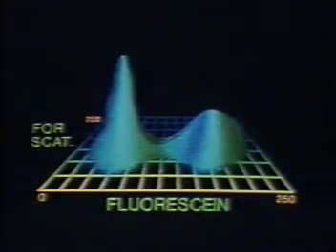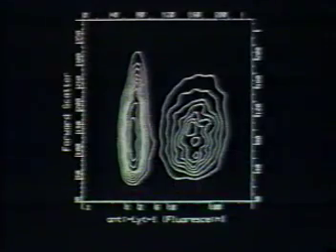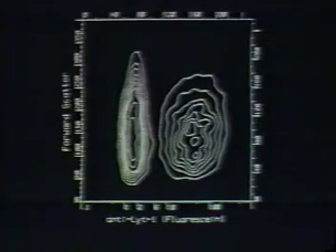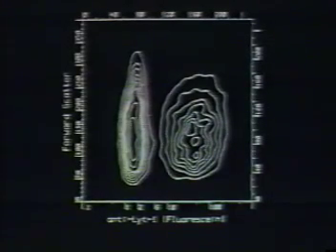From this vantage point, however, we cannot tell whether the two large peaks in the foreground are masking data in the background. To find out, we could print or display views of this landscape from several perspectives. However, FACS avoids this cumbersome procedure by generating aerial view contour maps that show all features of a landscape from a single unobstructed vantage point. From this overhead view, we can see data that was hidden to us. The shape of the far side of these mountains show us that each population contains a significant number of cells with higher scatter readings.